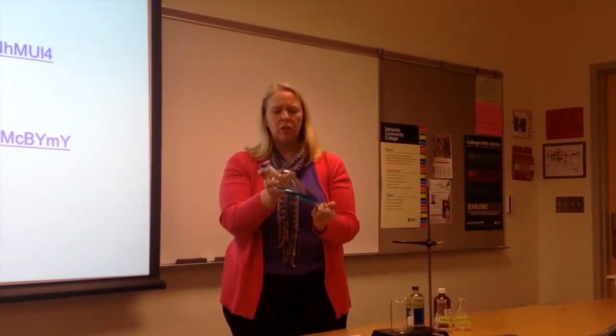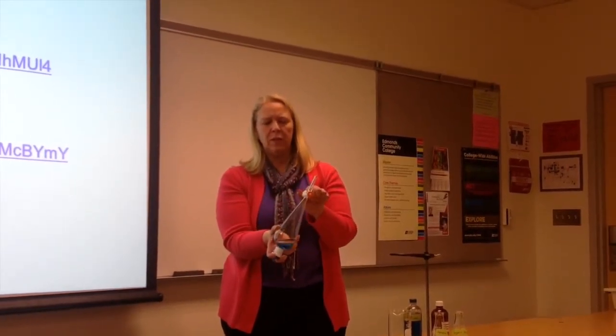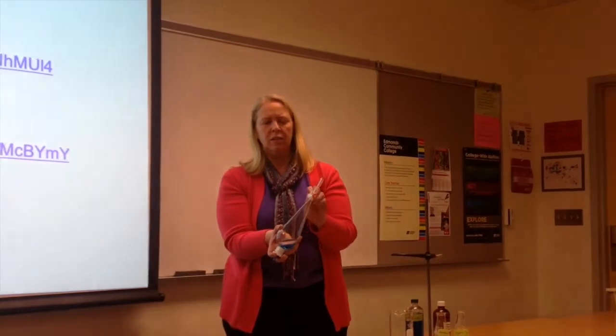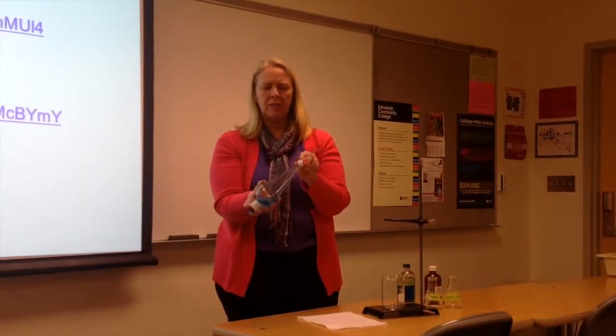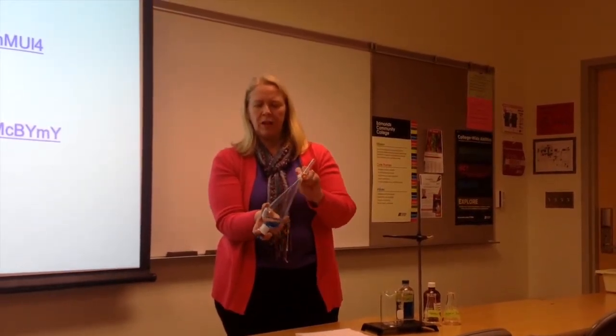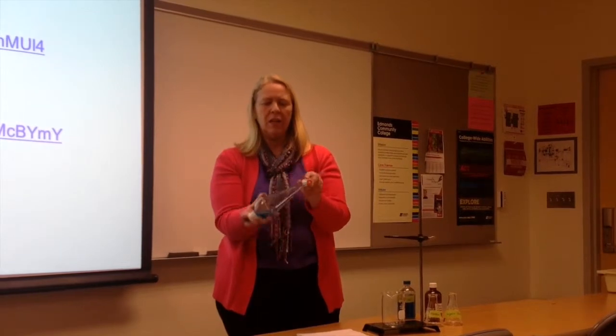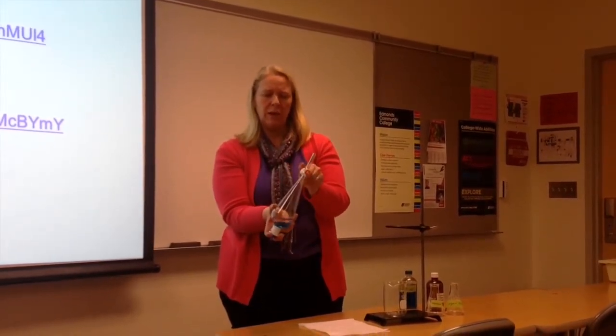And then you just want to gently rock back and forth a few times, and maybe, especially at the beginning, vent to release the pressure. You're going to rock back and forth a few times. And then you vent. You might have heard that hiss. That was a little bit longer. Especially ether is so volatile, you really do want to vent quite a bit.